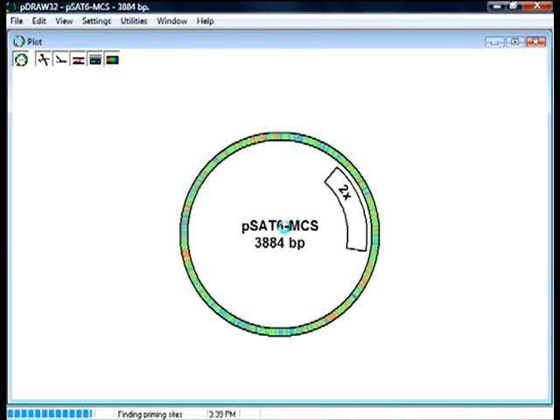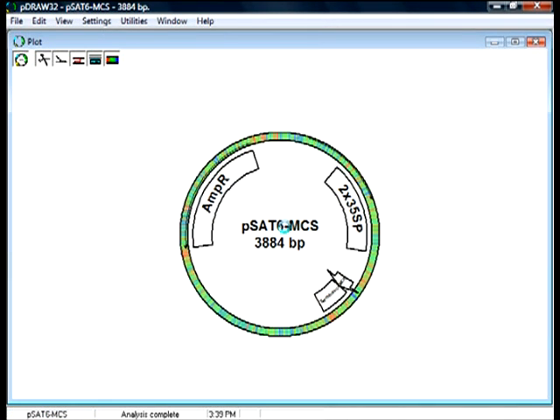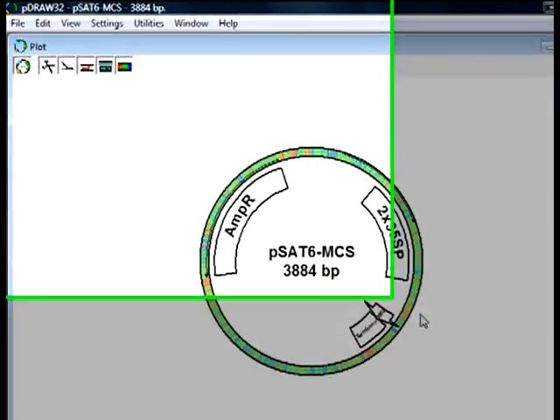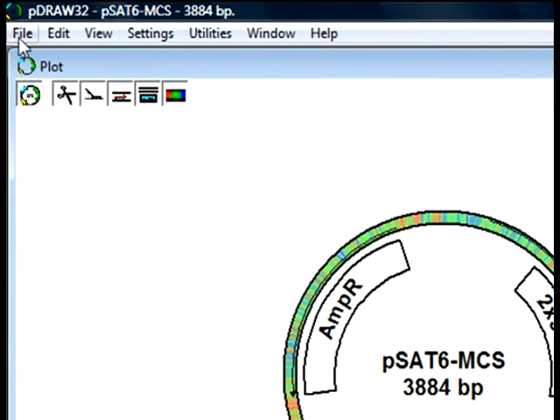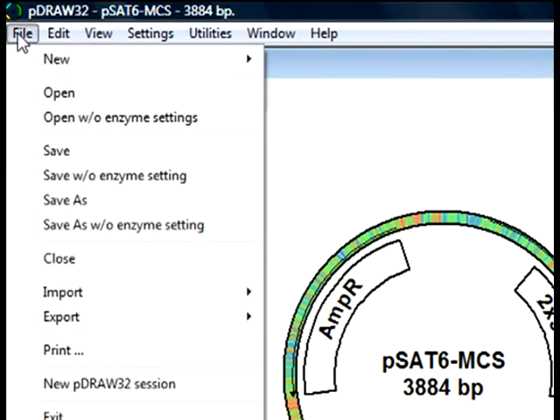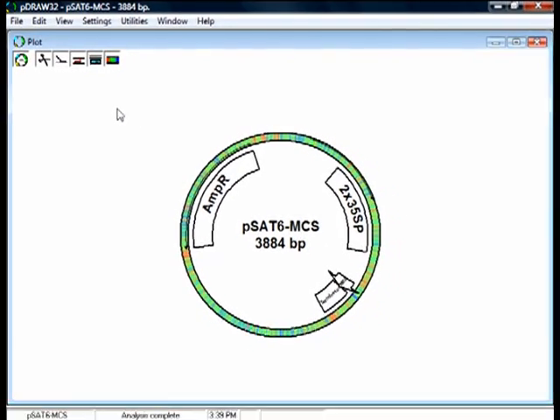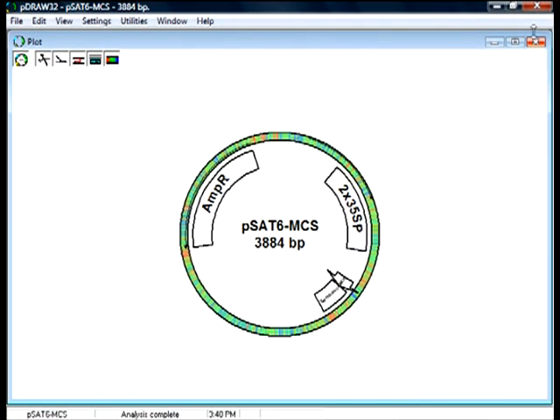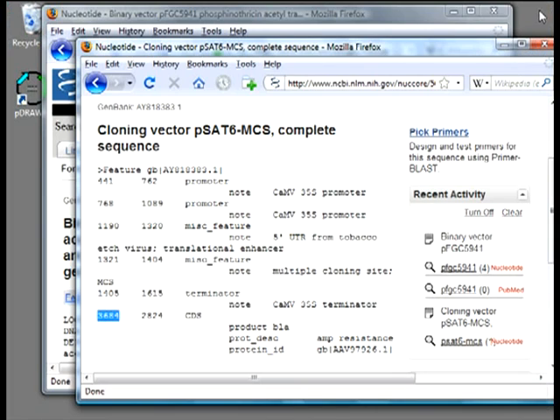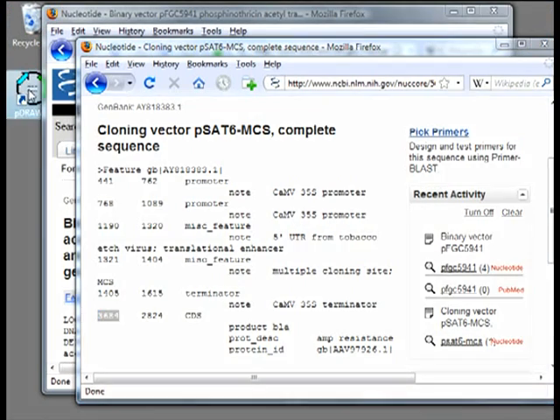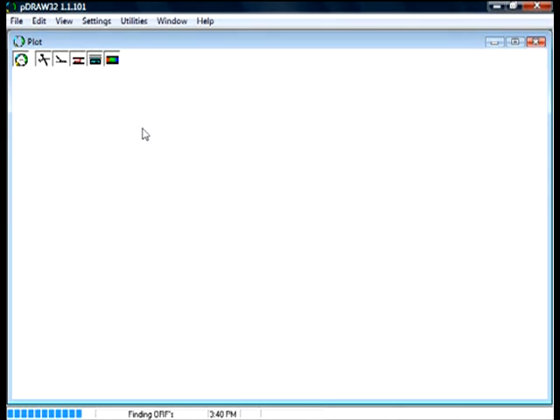Now it looks like a pretty map of PSAT6MCS. Let's save it. Notice that if you want to see the restriction sites on the plasmid map, you have to close and open P-Draw32.